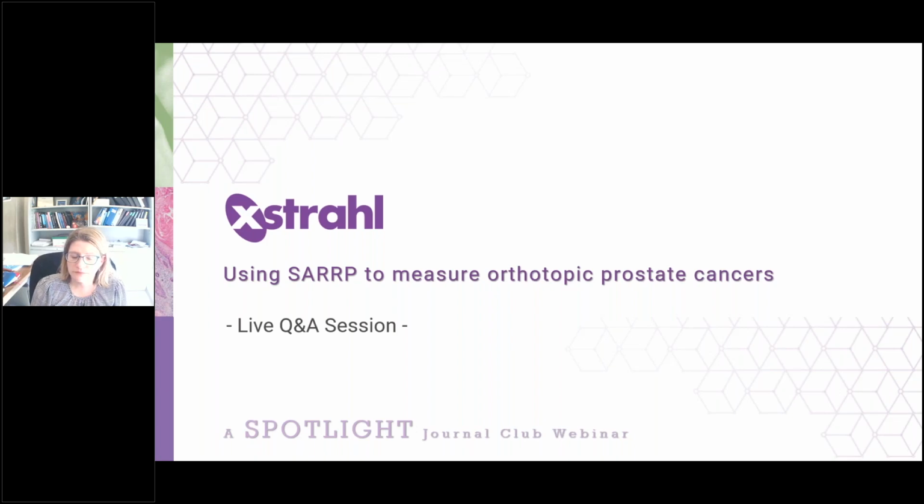Thank you. So the next question is: is there a contrast agent known to be used in living mouse for prostate? Not that I'm aware of. There may be some type of dye that you could inject like IV into the animal. I'm not aware of that. I don't know what's used clinically to look at the prostate specifically.